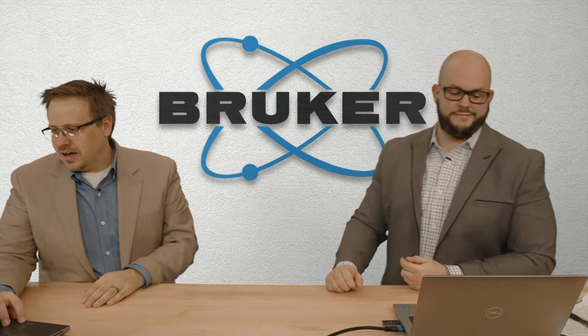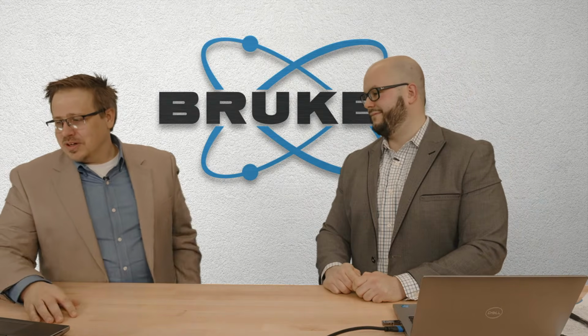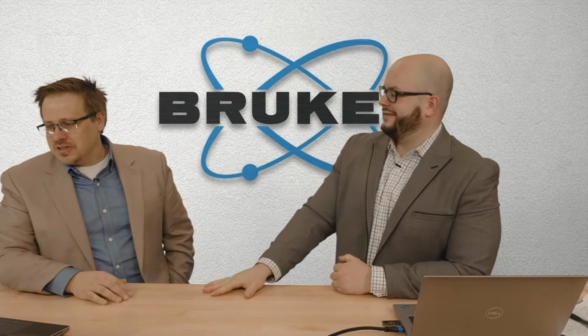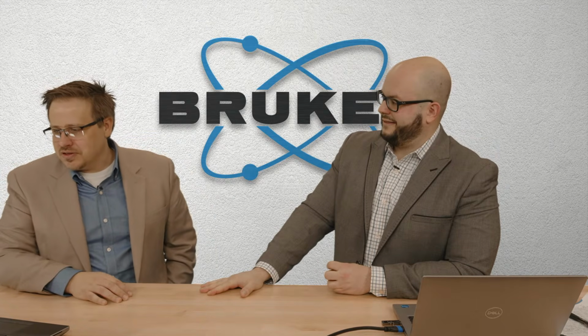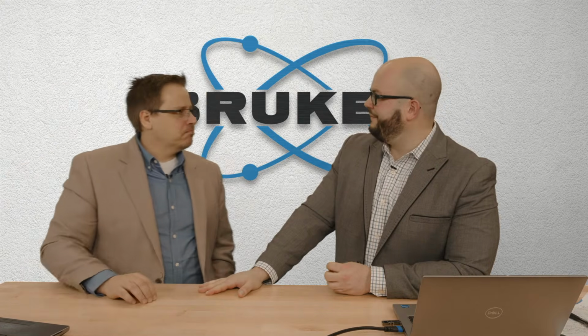All right. We have an answer from one of our application scientists in Germany, Kurt. Hello, JF. If you have a stress-free sample and still obtain a peak splitting, it could also arise from either a sample alignment error or a slight offset of the incident beam.